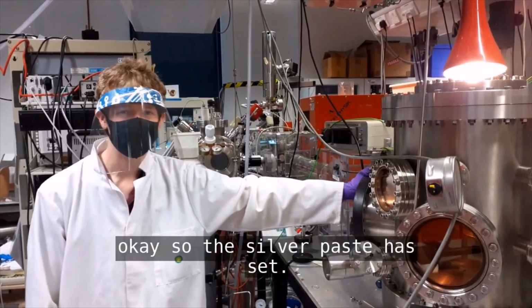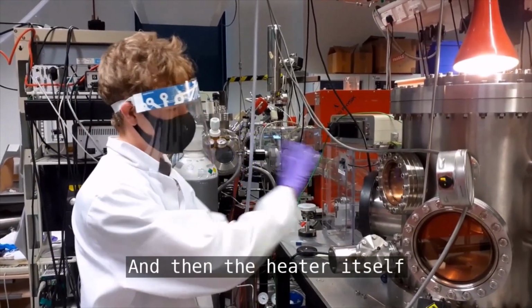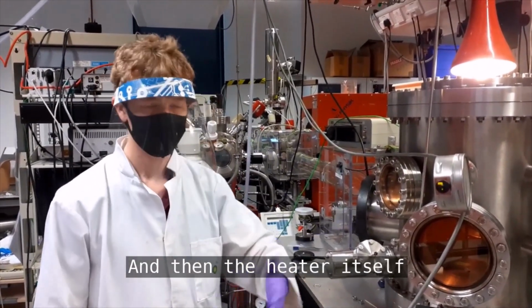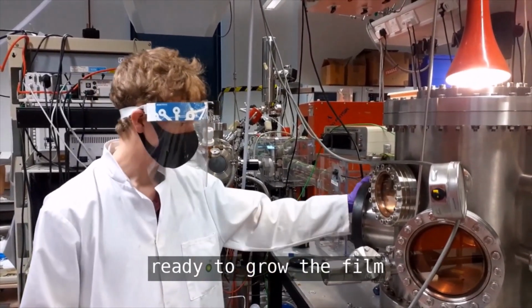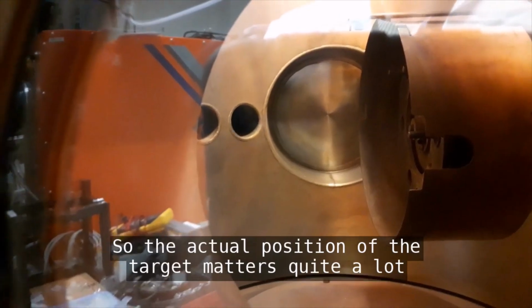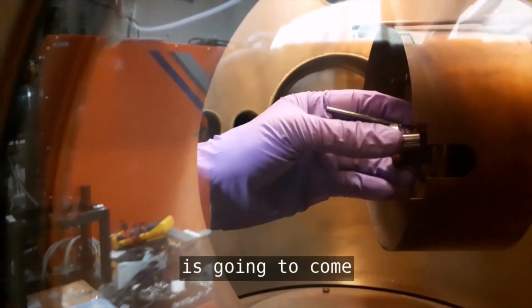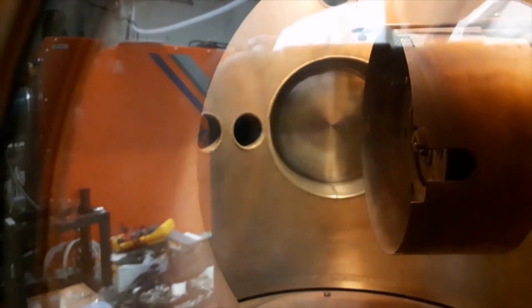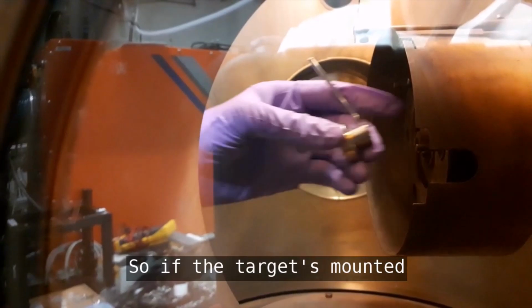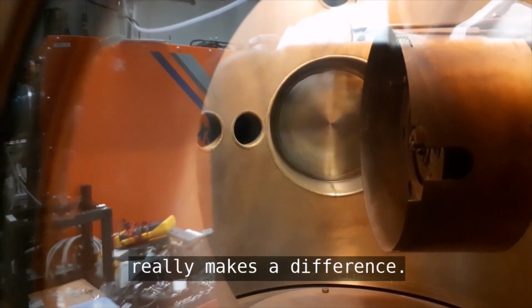Okay, so the silver paste has set, so now we just need to load in our target and then the heater itself, and then we're going to pump it down, ready to grow the film. Now the actual position of the target matters quite a lot, because the laser is going to come through here and it's going to be focused at a very particular point. So if the target's mounted too far one way or too far another, it really makes a difference.